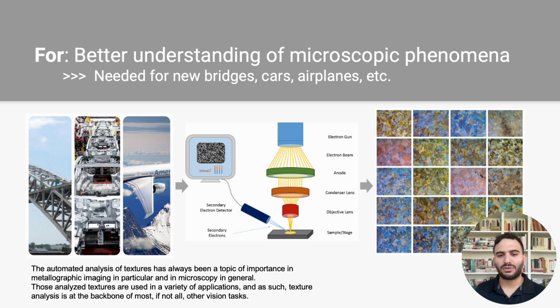Investigating the microstructure of a material allows one to discover important properties of that material, such as the corrosion behavior, electrical properties, and so forth. Microstructure study is therefore considered to be among the most beneficial and effective fields for understanding materials' properties, and is needed for building new bridges, electric cars, or lightweight airplanes.